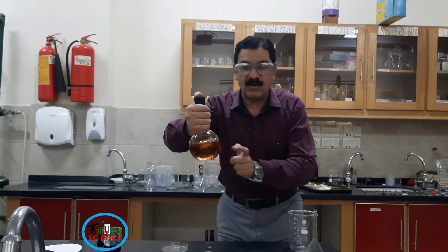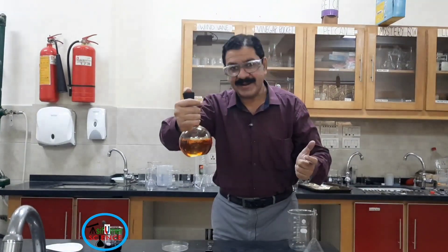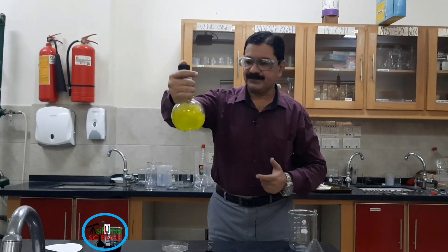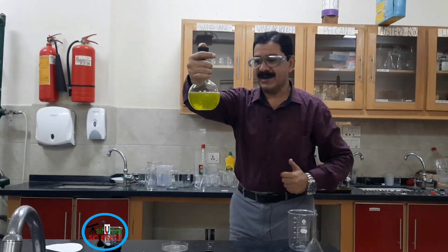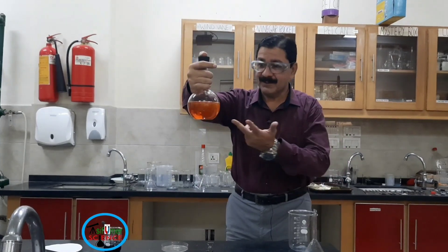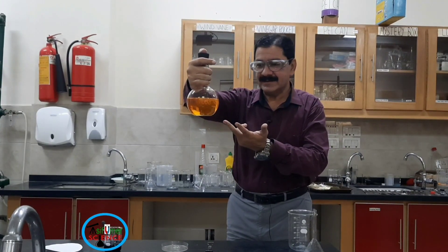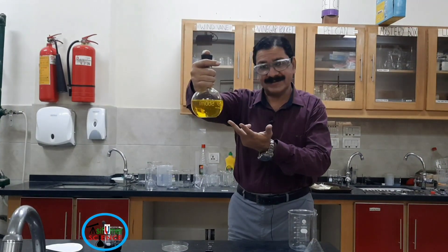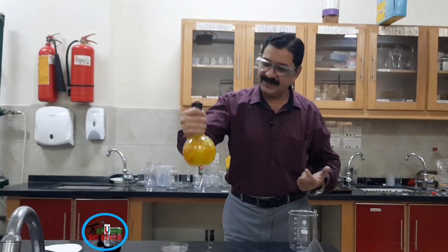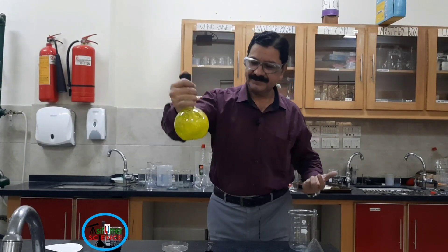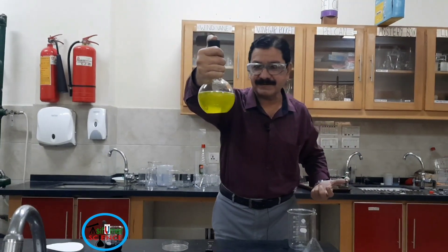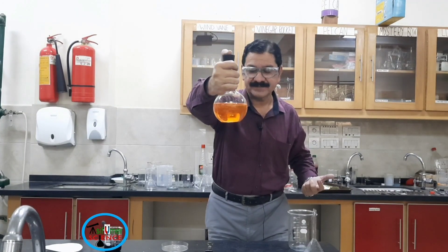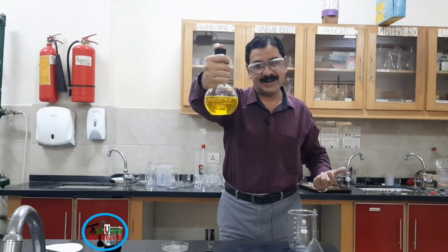Now our traffic light bottle solution is ready. If I shake it, the color turns green, and after some time red, and then yellow color. Again if I shake, the color turns green, then red, and then yellow.